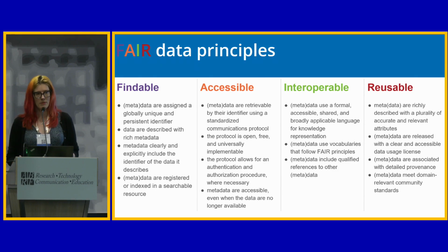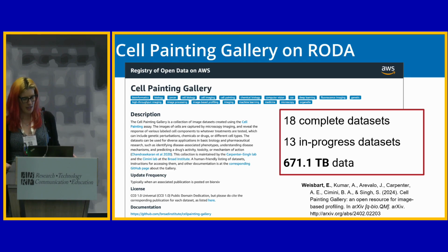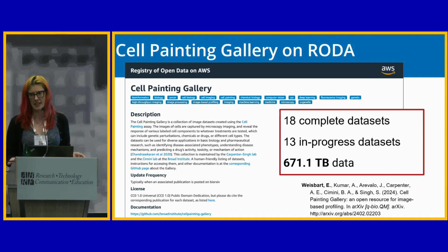And that democratizes such things so that people who do not have the resources to generate the data are still able to mine it for many, many things that I'm sure whoever has generated it has not fully delved into. One example of that, so I'm lead curator, I guess, on the Cell Painting Gallery in RODA, where we have now almost 700 terabytes of cell painting data and corresponding morphological profiles that are freely available for anyone to access.